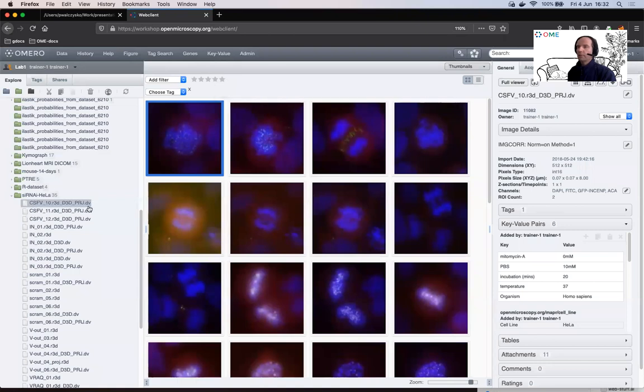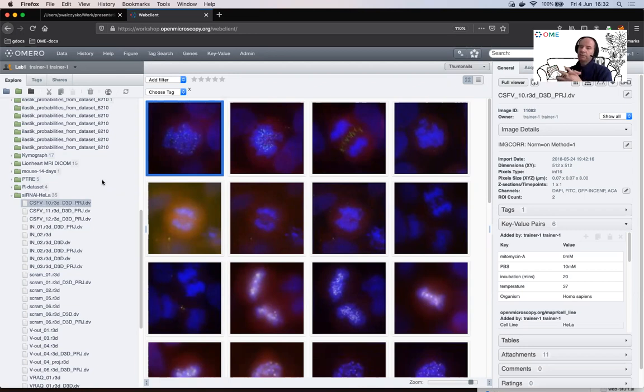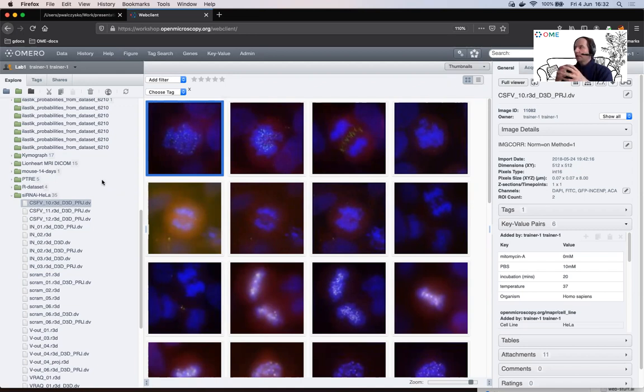In the demo I will lead you through the simple but powerful workflow where the scientist is acquiring the images on a microscope then imports them into the OMERO server.